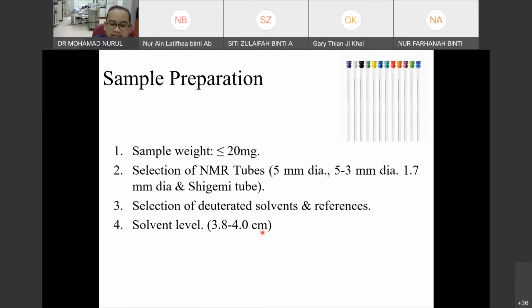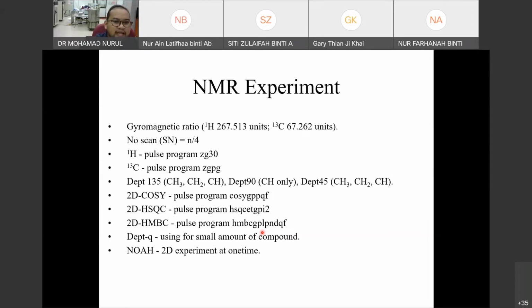Firstly, this is very important. Deuterated solvent is quite expensive. For CDCl3, the cheapest one, 100 ml is around 600 ringgit. So use wisely, it's not cheap actually. For DMSO, it is thousands for 25 ml. As I know, the school will provide around a 500 ringgit virtual account. So use wisely.